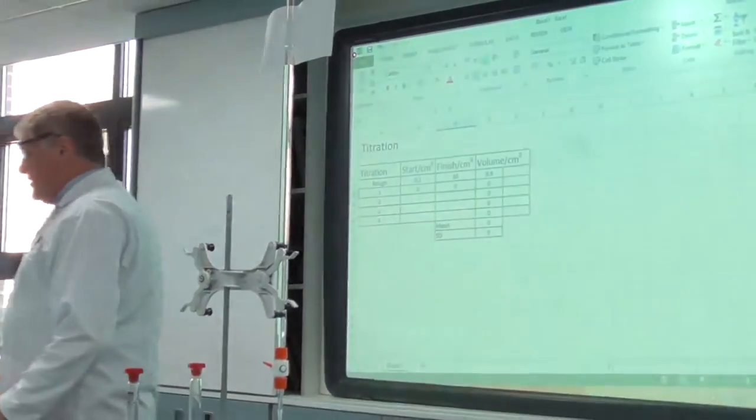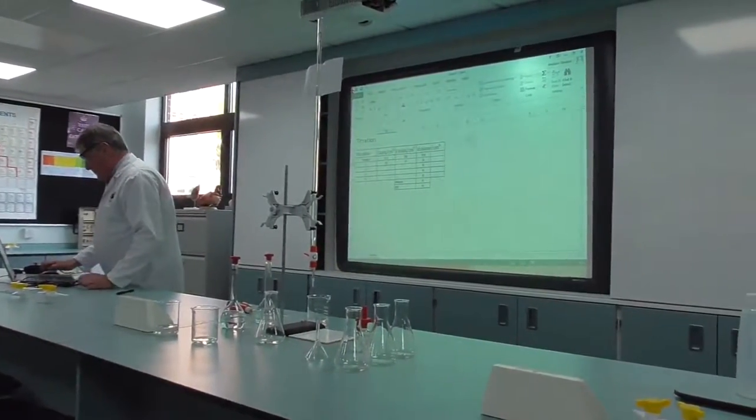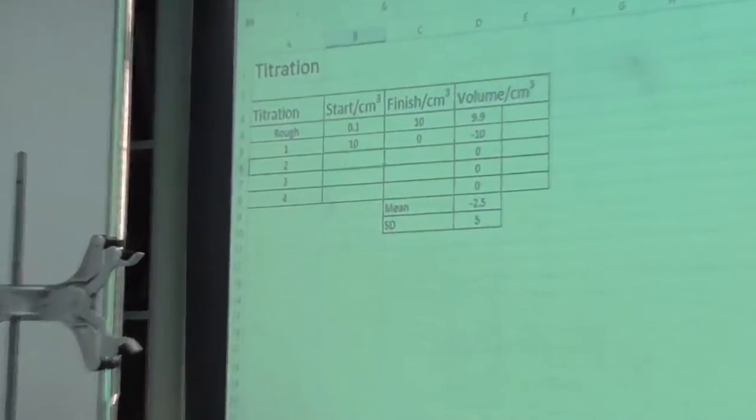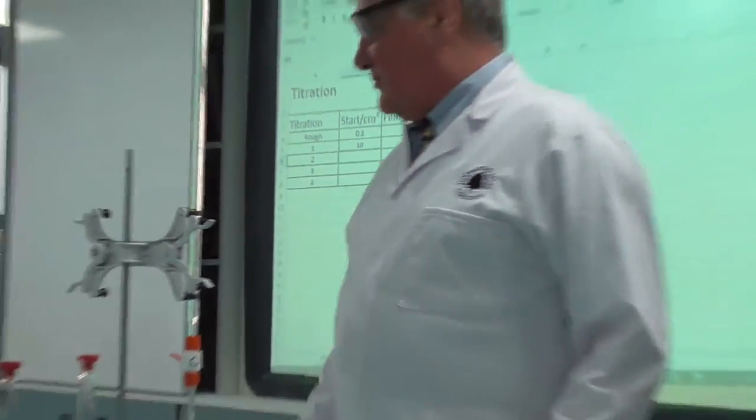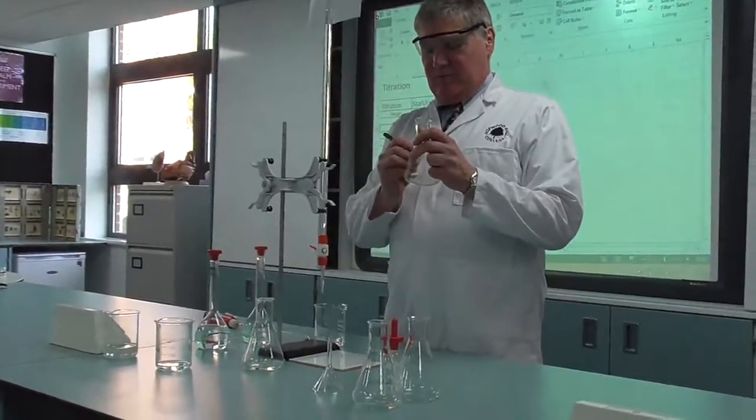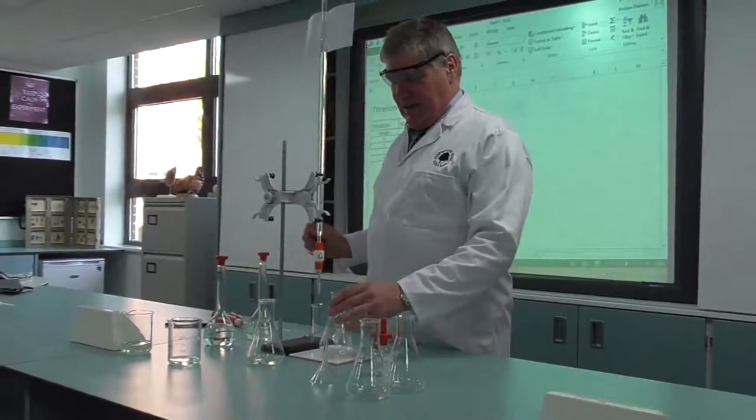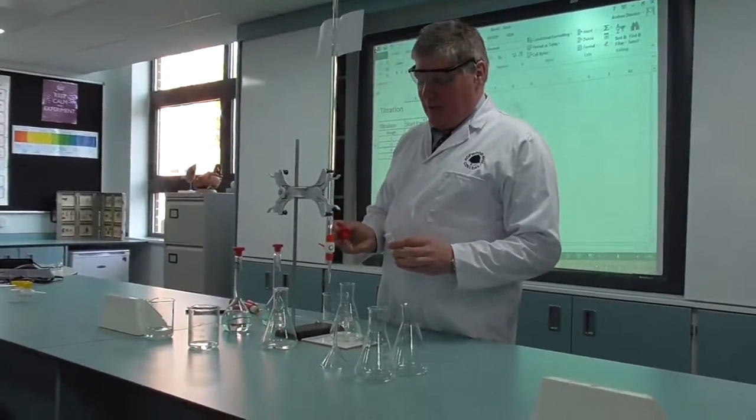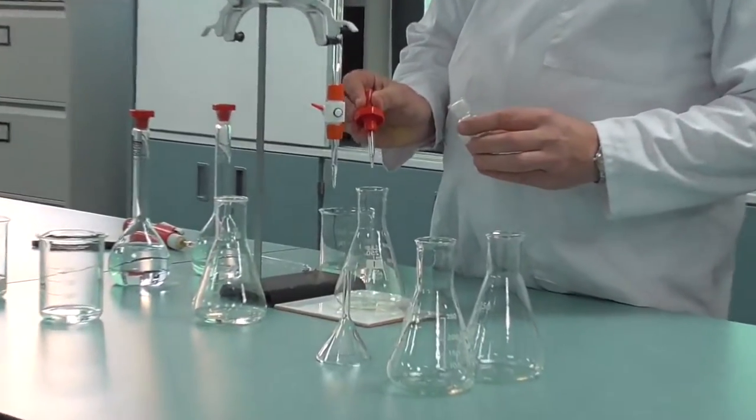Coming back to my titration, this is our second titration, first proper one. The first one is just a rough one. Again, I'm going to add exactly, or as near as I can, the same amount of indicator: one, two, three.